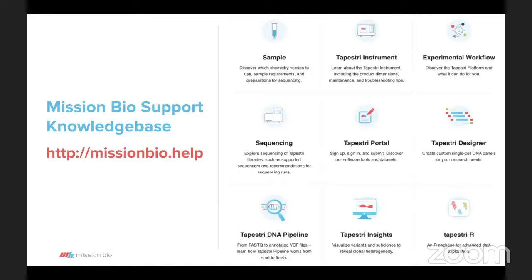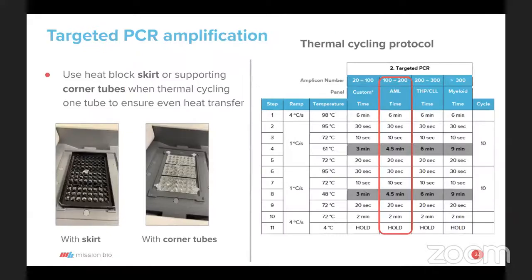It was incredibly enlightening. So we have a few questions about the PCR thermal cycling. This attendee noticed that the ramp rate changes, and they're just wondering why and why that's important.